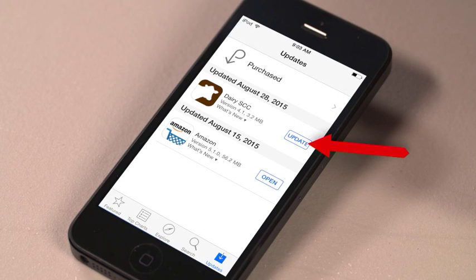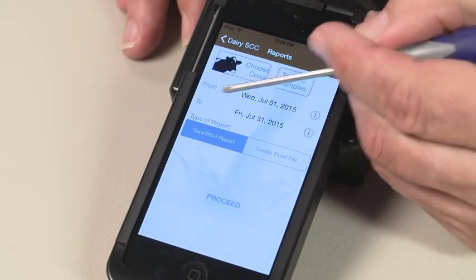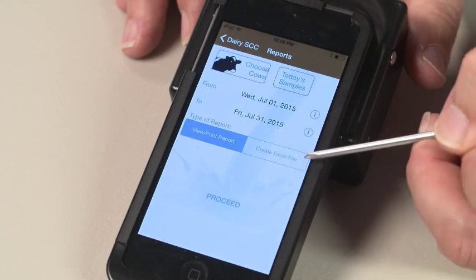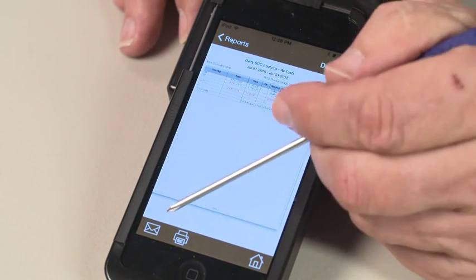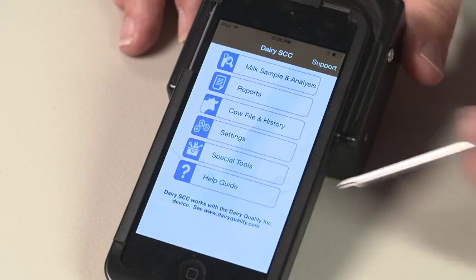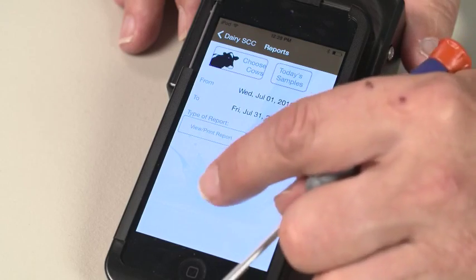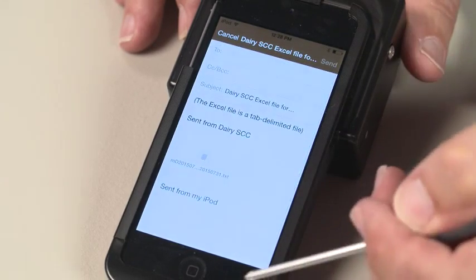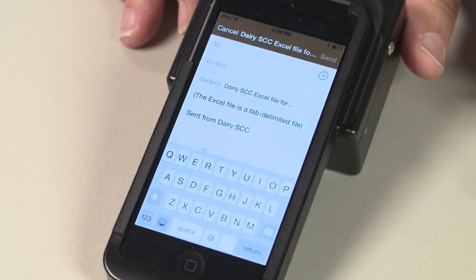Please note you will need to be connected to the internet to update the app. To use the report function on the RT10 device, tap Reports. Define the timeframe using the From and To fields. The default setting is Report — tap Proceed. To email the report, tap the envelope icon. To print the report, tap the printer icon. Please note an internet or network connection is required to email or print reports. You can also create an Excel compatible data file by tapping Create Excel File and tapping Proceed. This will bring you into an email screen. Note you will need an internet connection to send the file via email. To cancel, tap Delete Draft.